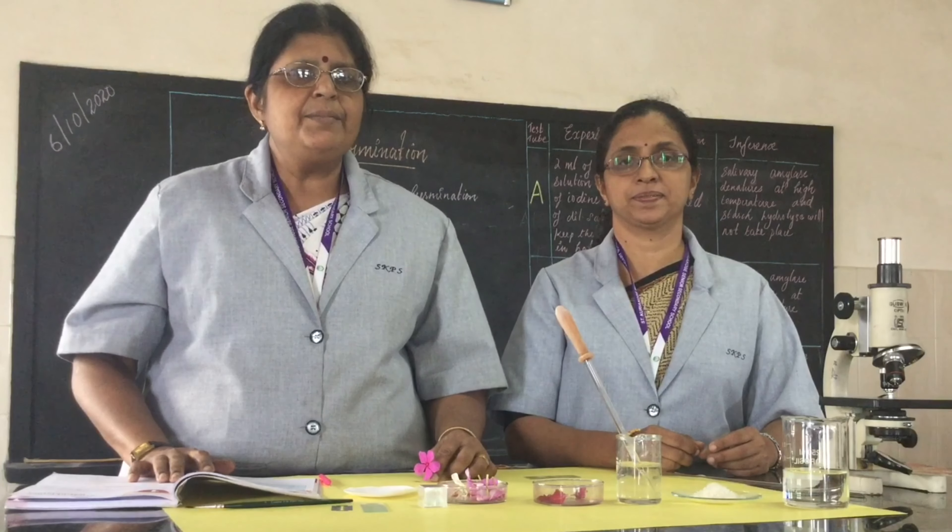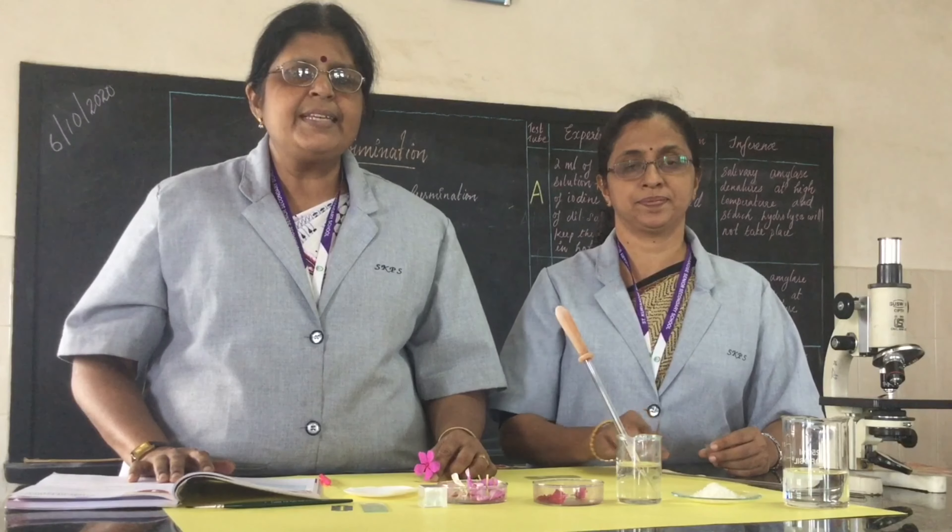Good morning students. Today we are going to demonstrate the first experiment, that is pollen germination. The aim of this experiment is to study pollen germination on a temporary slide which you have to prepare.